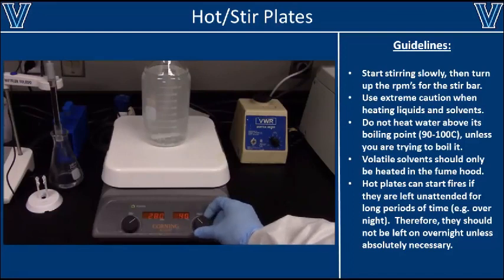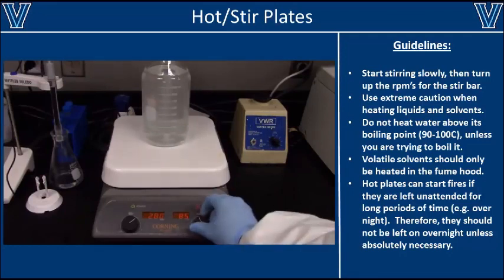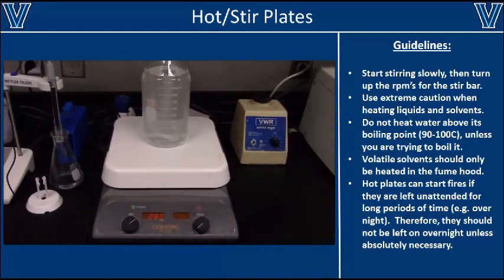Please remember to use extreme caution when heating liquids on a hot plate. For example, do not heat water above its boiling point, which can be 90 to 100 degrees C, unless you are explicitly trying to boil it. Volatile solvents should only be heated in the chemical fume hood to avoid inhalation of any harmful vapors. Finally, hot plates should not be left on at high temperatures for extended periods of time. For example, try not to leave a hot plate on overnight, since it is not uncommon for hot plates to overheat and create a fire hazard when left unattended.